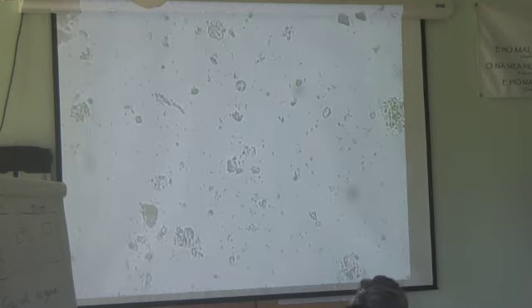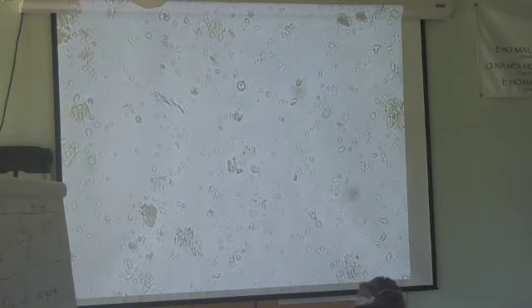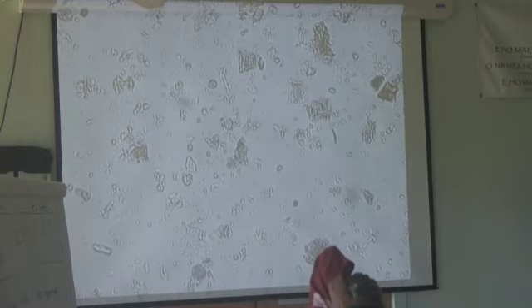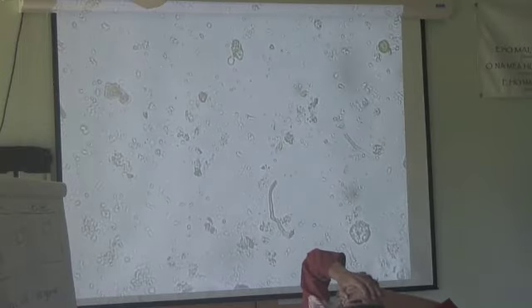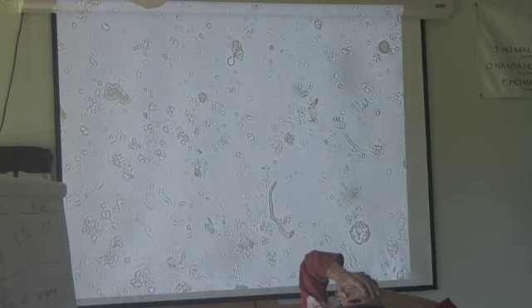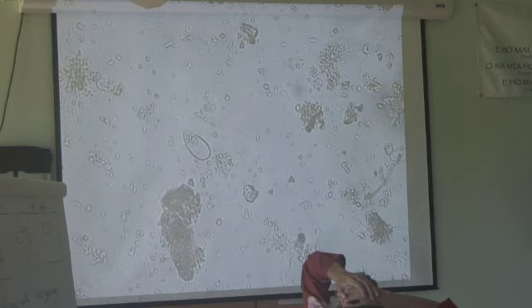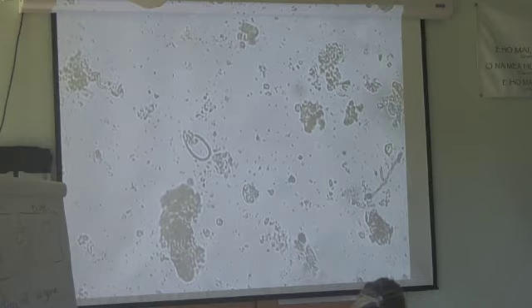So, can we come to a pretty good conclusion that this compost has a lot of bacteria, a little bit of fungi, so now that's probably a little bit of fungus right there, you know. But it really needs to work on flagellates, so we need a few more active protozoa, and we need a whole lot more fungi. Okay, so it might be good for certain types of things, but maybe not so good for things in our veggies or our lawns.